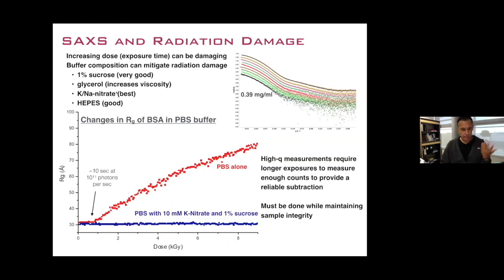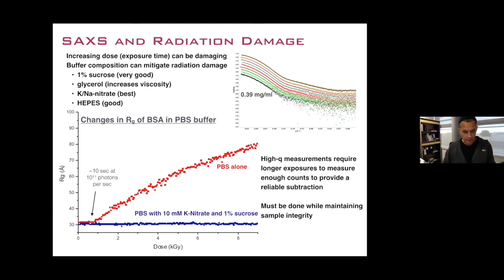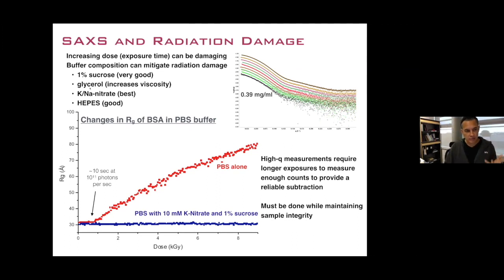This was done in PBS. We did a very long exposure with BSA and can see that in PBS alone, as we collect frames and reach a certain dose, the scattering is increasing, telling us we have radiation damage or aggregation. To mitigate that, you can add an additive like sucrose, glycerol, potassium nitrate, or HEPES. With PBS plus potassium nitrate and sucrose through that same dose experiment, we don't see any increase in radius of gyration.